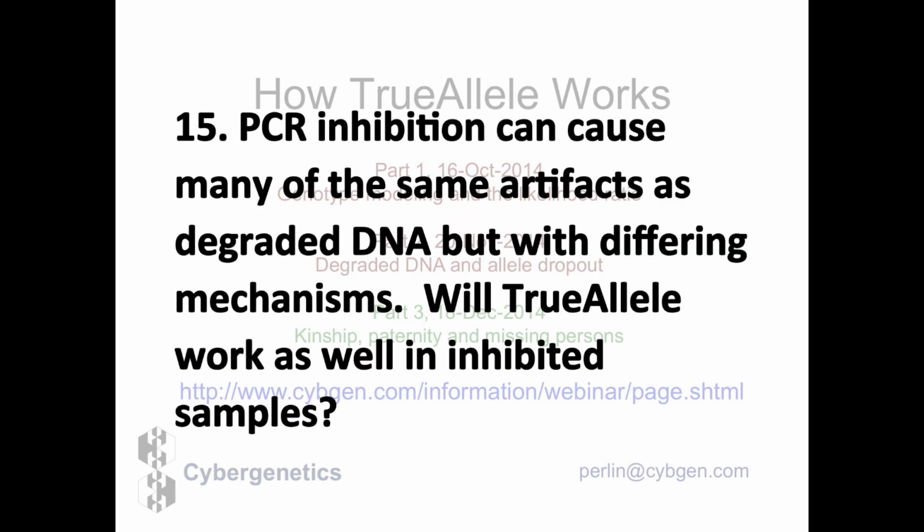The next question is, PCR inhibition can cause many of the same artifacts as degraded DNA, but with different mechanisms. Will TrueAllele work as well in inhibited samples? The answer is yes. The data looks very similar in those circumstances.